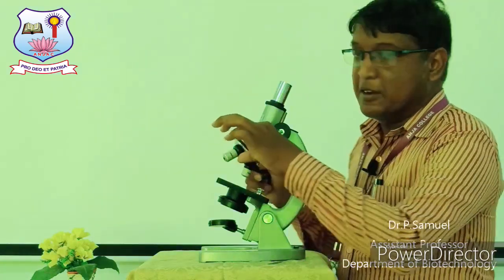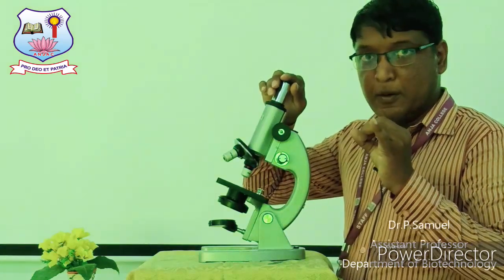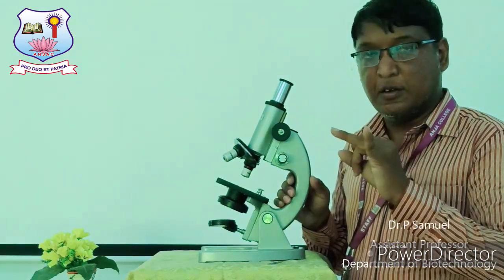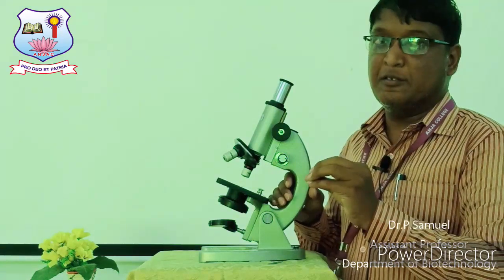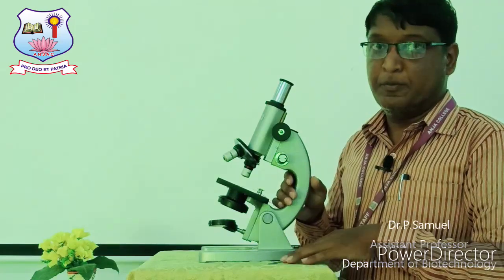There are three types of lenses in the nose piece. One is low power, the second is high power, and the third is oil immersion lens. The magnification power of the low power lens is 10x. The magnification power of the high power lens is 45x. And the magnification power of the oil immersion lens is 100x.